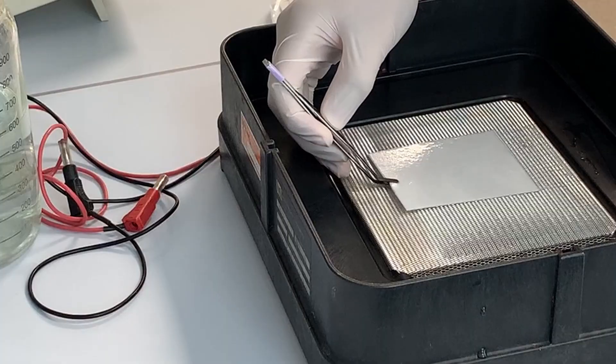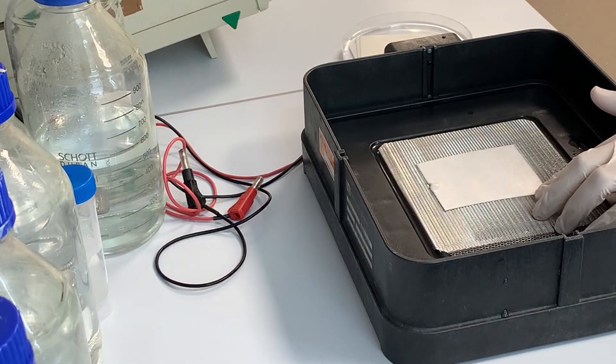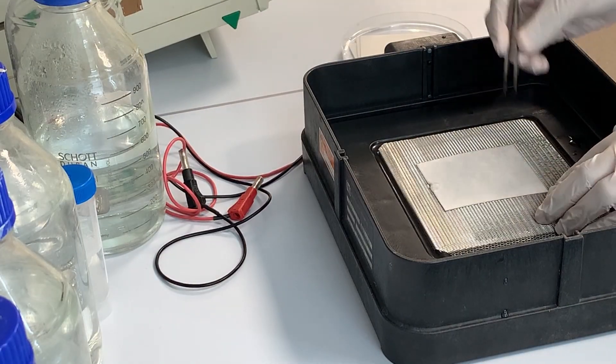Next I assemble the sandwich. First I put two Wattman papers over each other. Make sure that they stick to each other. You can roll over them with a plastic tube if you are not sure.